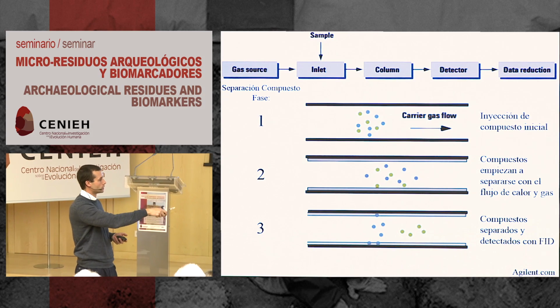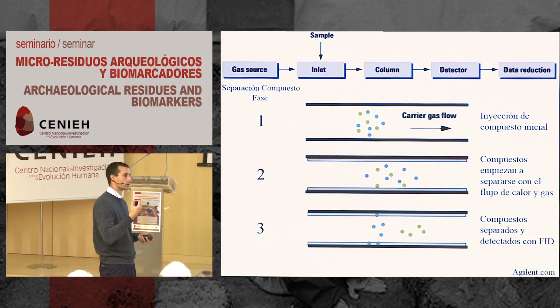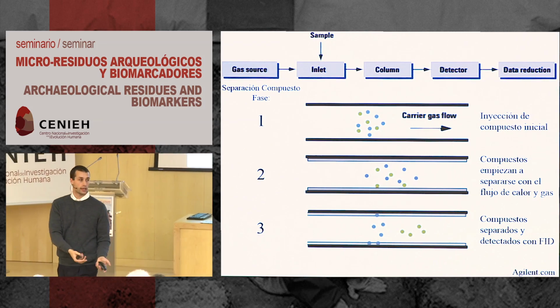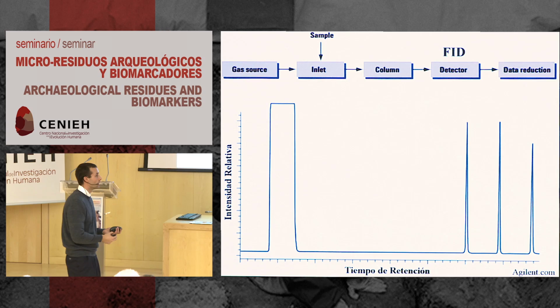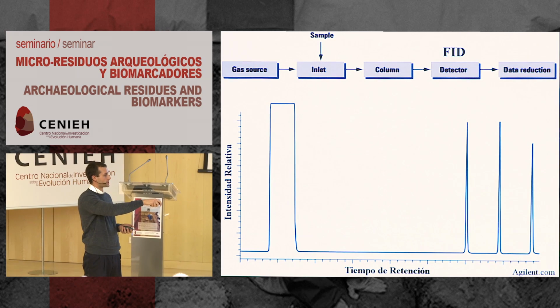And then towards the end, you really have separation based on molecular weight. So heavier items take a little bit more energy to break apart and separate out, whereas lighter stuff, like hexane, for example, is a low molecular formula. It would be shown early on. And then our resulting output is a simple chromatogram of time and then compound abundance.